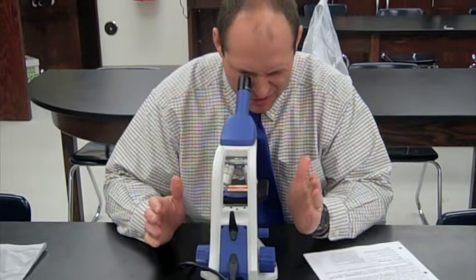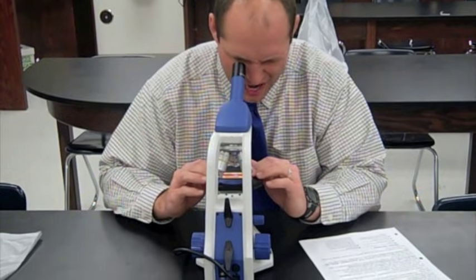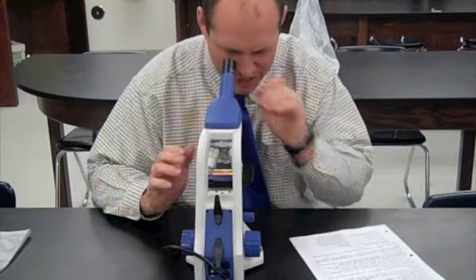Okay, now that I have it in focus, I want to make sure that it's centered within my viewing field. That way, when I switch to high power, it'll always be focused in the center there so we can see it.